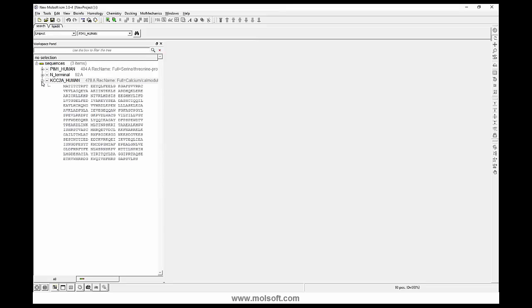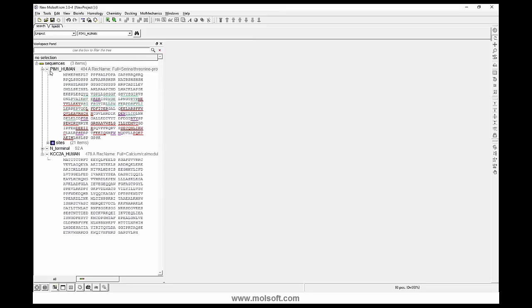This one, you notice that this sequence we read from UniProt actually has some secondary structure annotated. We can see that underlined in green means beta sheet. Red is alpha helical, and magenta and blue are sort of non-canonical helix. So magenta is a 310 helix, and if you had one underlined in blue, that would be a pi helix.